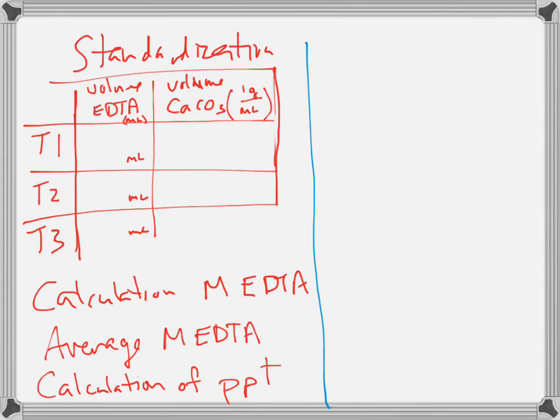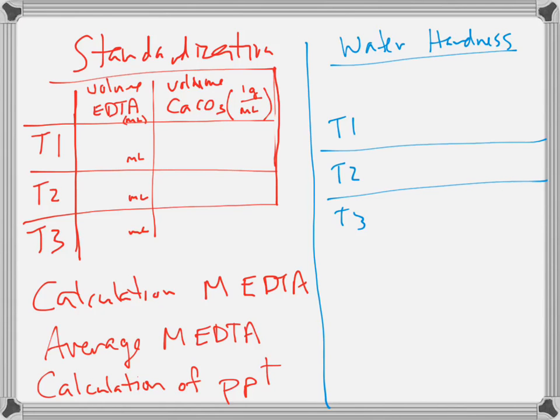The other half of the experiment was now the water hardness. You'll have, again, at least 3 trials. What things can you tell me about those 3 trials?